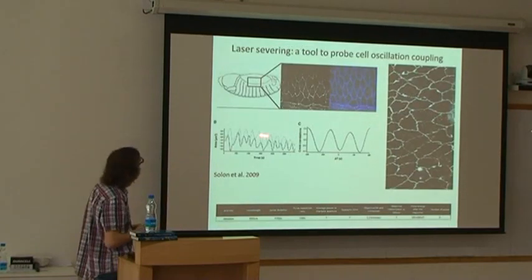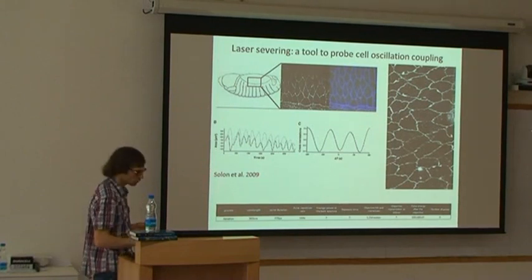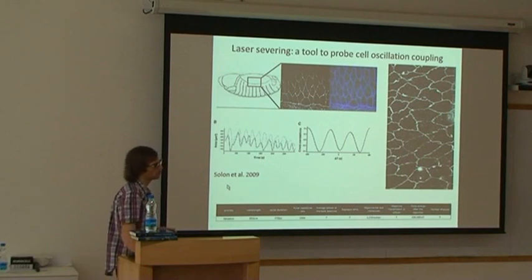Okay, this is another work that has been done by Solon et al. in 2009 that will show you other ways to use laser dissection. So Solon was interested in a process. How small is that? So at most it's 400 nanometers.